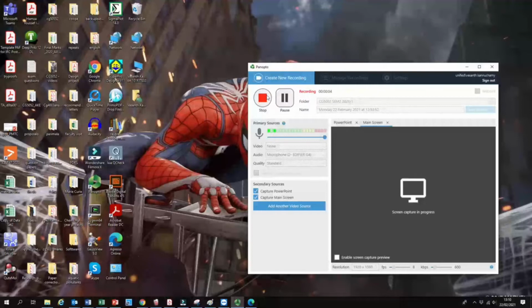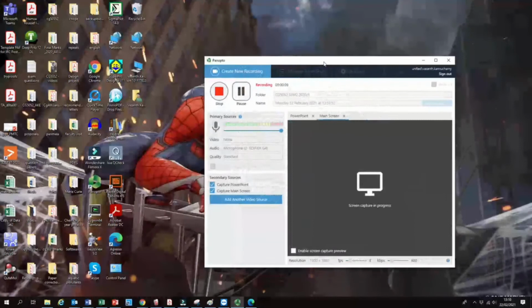In this video, I'm going to solve the problem which I stated already in part 1. It's a very simple problem to solve using SuperPro Designer software. In this tutorial you will also know what the software looks like, how to open the software first, and then what the graphical user interface looks like, how to drag and drop the different unit operations, how to add some input streams, how to take the outputs, how to add some output streams in order to collect your output, and also how to connect two different unit operations using this software.